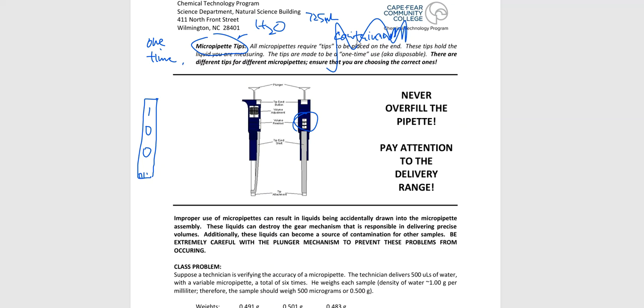When I begin to talk about dialing in these micropipetters, you need to understand that there is a trick we've got to do with some of the student versions of the micropipetters that are on the larger scale in the house. So, let's say that I pick the largest micropipetter, and that goes from 1,000 to 100 microliters.